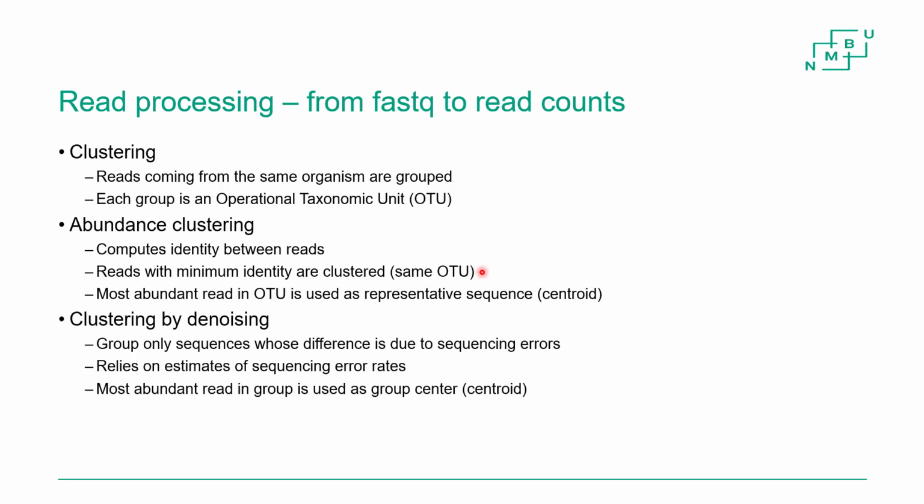There are sometimes small variations between these, even if they are inside the same genome. So it means that looking for all variants of a sequence is a little bit too much resolution, I would say, because we want the reads from the same genome at least to be grouped together, and we typically want even bigger groups than that, right? Even the same species or even the same genus should be grouped together.